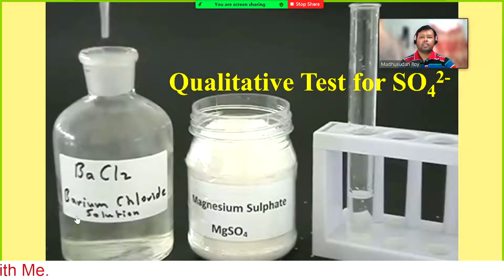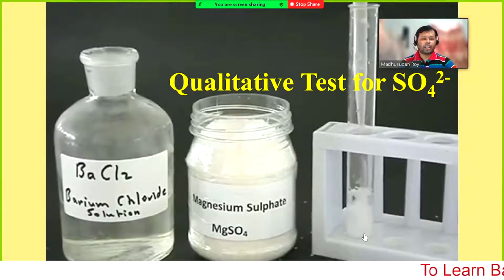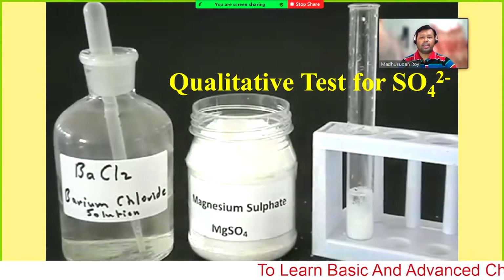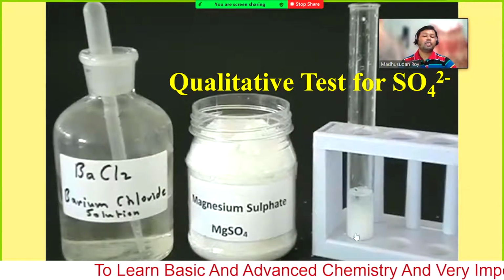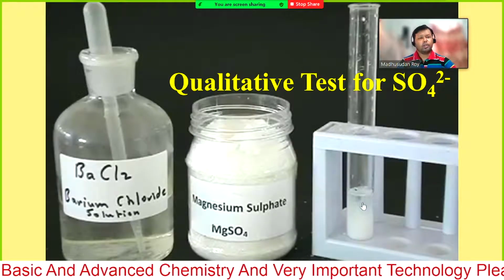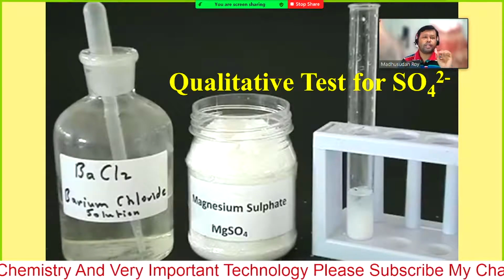Taking the barium chloride solution, just look. With a single drop added, the precipitation immediately started to appear. Previously it was a little bit turbid, not a white precipitation.